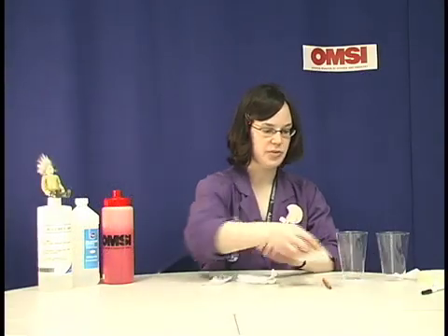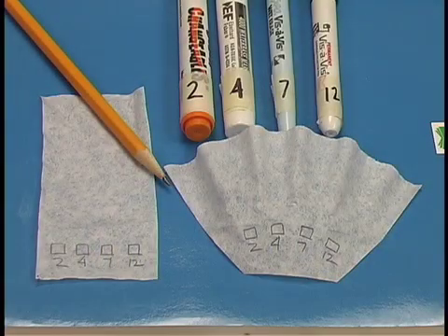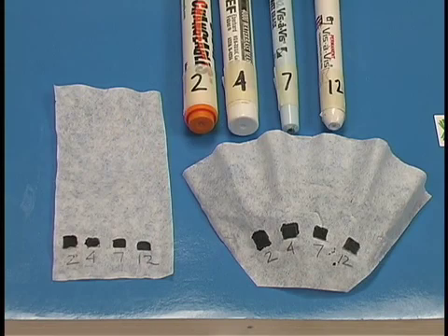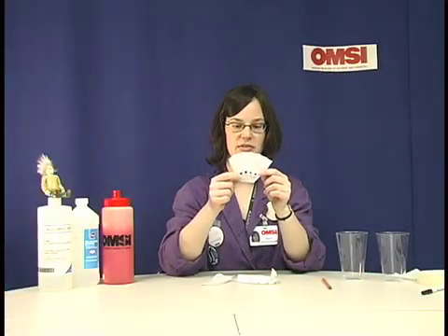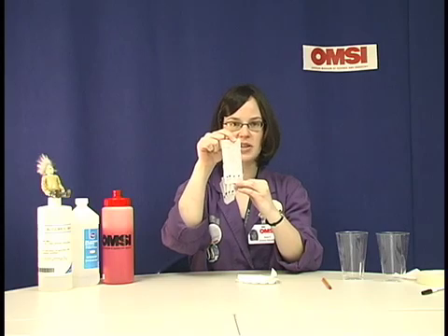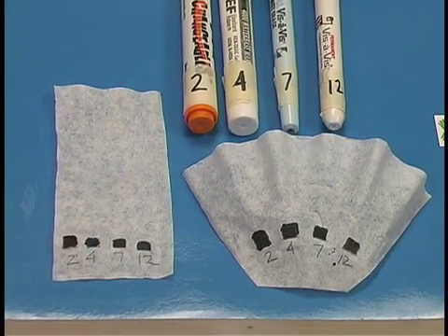Label your filter paper with different boxes using a pencil — you do have to use a pencil for this step. Then you can color in boxes with the different kinds of markers. We have our markers labeled with different numbers so we can identify them easier: 2, 4, 7, and 12. The ink should be about a half an inch away from the edge of the paper, so you have some room.